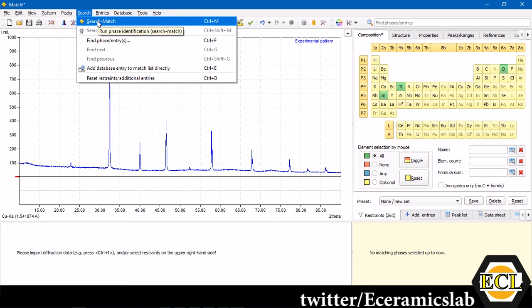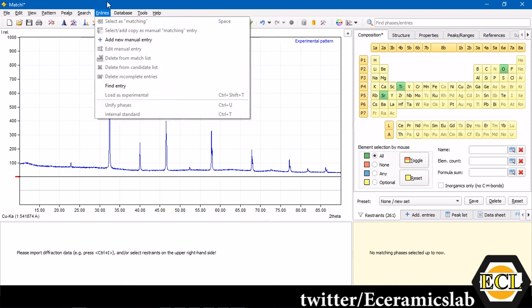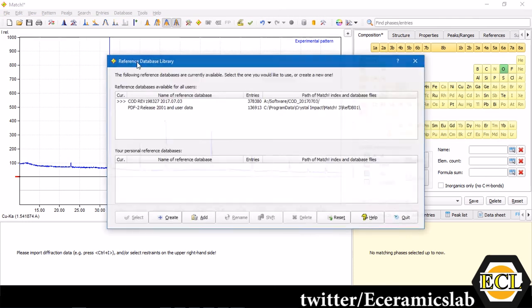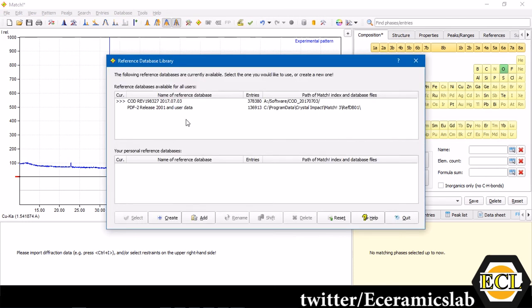Once you click it, this software will search all those compounds which have the element strontium, titanium and oxygen in its database. That's why you have to have the database already fed into the MATCH.